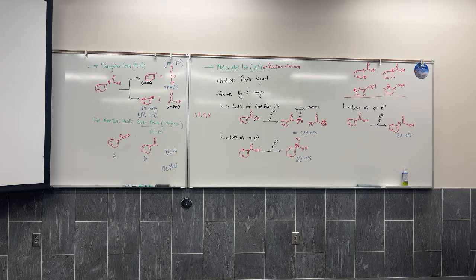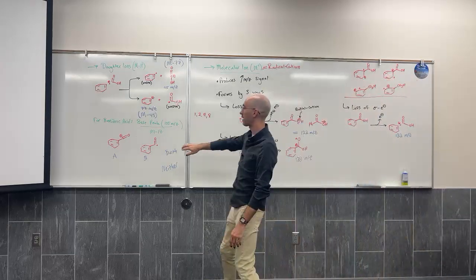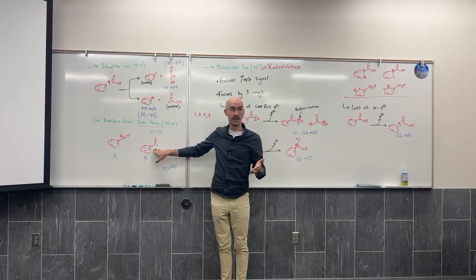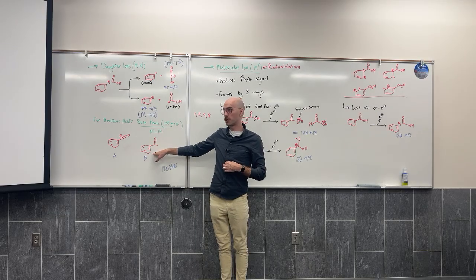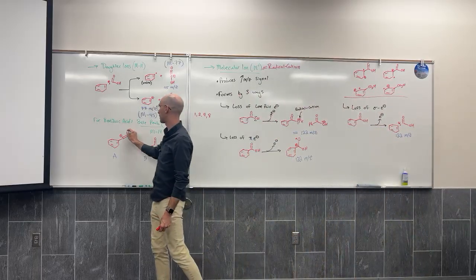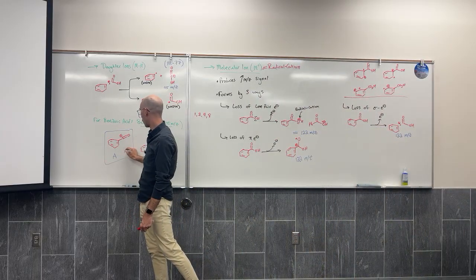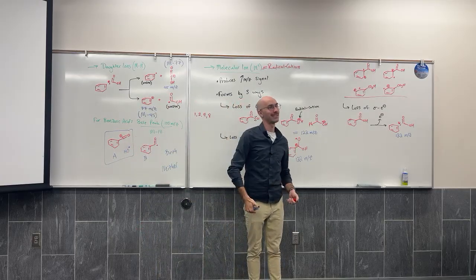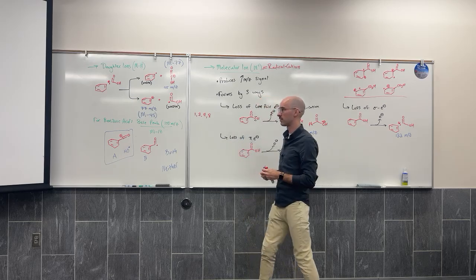Exactly. The magnetic field has no impact on this radical fragment, which does have a mass of 105. It doesn't matter that it has the correct mass. It doesn't have any charge. So this doesn't hit the detector. It certainly doesn't give a reading of 105 mass per charge, because the charge is 0. So only A produces the M-17 signal. And it forms that because of the loss of that hydroxide radical. The OH radical is kicked out, and everything else then has a mass of 105.